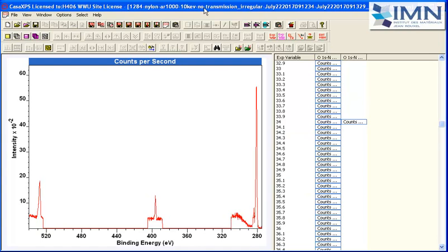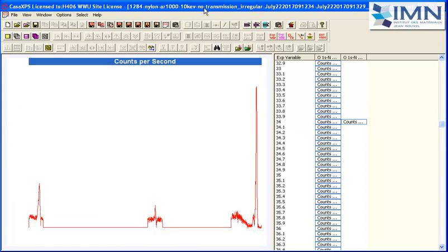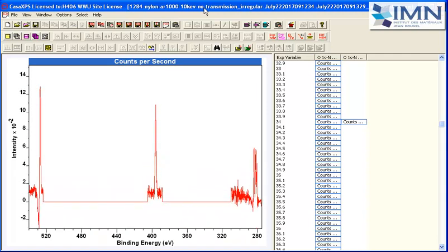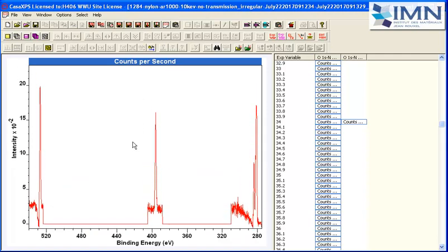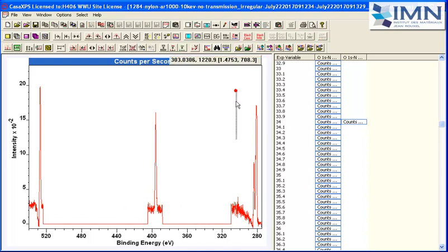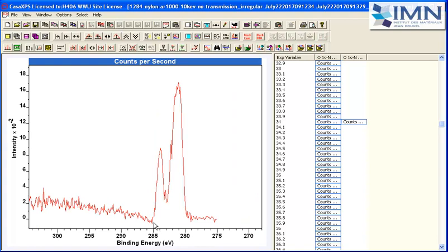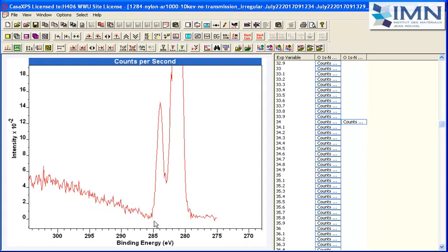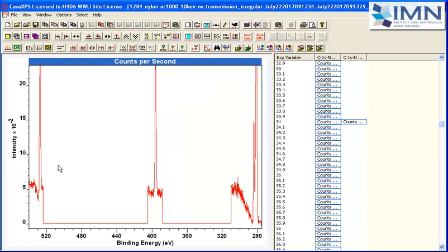And the idea is that we find two different spectral forms. Both need to look physically meaningful. So when I arrive here and I see a sharp drop here, or a deep valley here with some not as meaningful as I would like to see in terms of what I'm expecting from these data, I will carry on going, and that's what the carbon looks like. And we'll look at the others. So we've still got something happening over here.